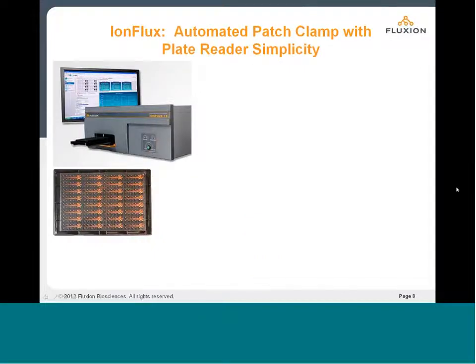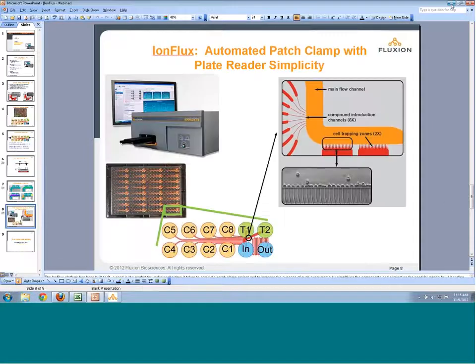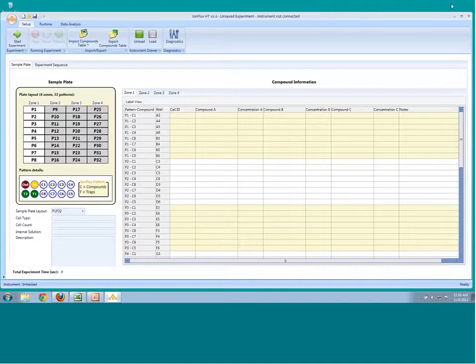Okay, so now what I want to do is actually step out of the presentation, and we're going to step into the IonFlux control software, which is shown here as the main page of the IonFlux application as it would be opened up. And what we see on this main page is that we have a table for defining the compounds that will be in our wells, as well as our recording zones.